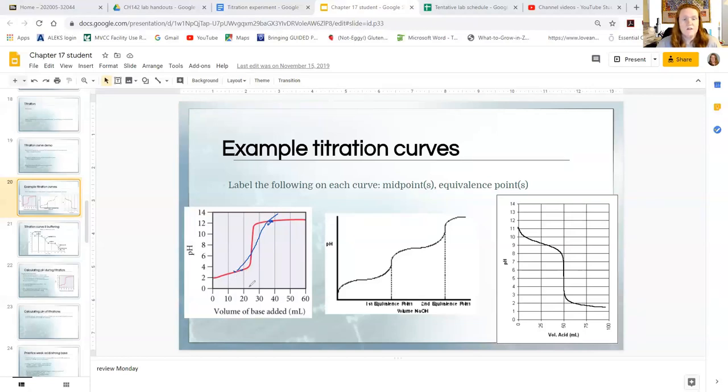Okay. So yeah. So if it was 30 mills for my rough titration, when I measure the pH in the next run, I'm going to do like zero to 27 or 28 at one mil increments. And then when I get to 27 or 28, I'll make it much smaller, like half or even a quarter of a milliliter at a time. And that'll allow you to get a nice S shaped curve.